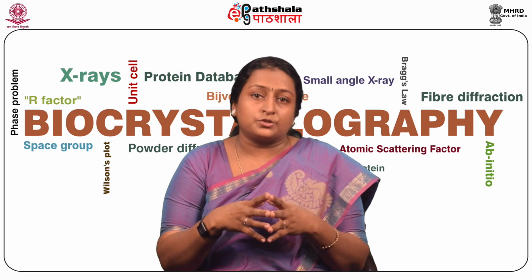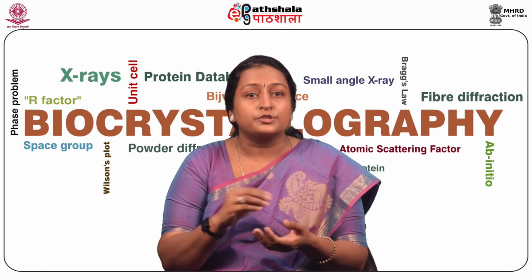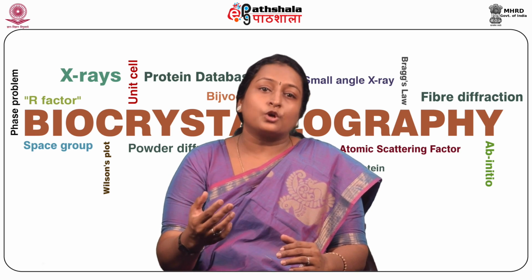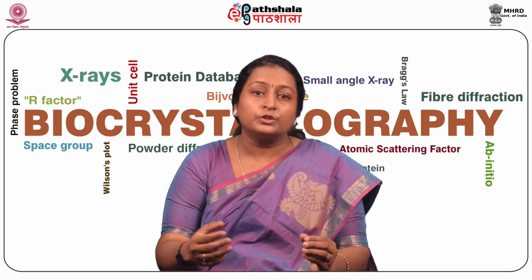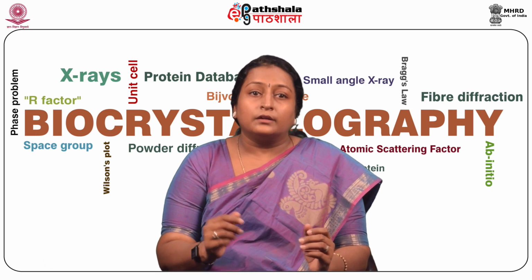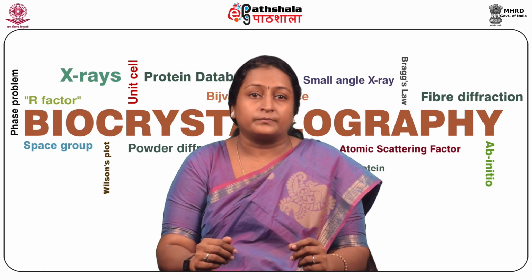Some of the important characteristics of samples for X-ray powder diffraction: a flat plate sample should have a smooth flat surface. If the surface is not smooth and flat, X-ray absorption may reduce the intensity of low angle peaks. Parallel beam optics can be used to analyze samples with odd shapes or rough surfaces. And densely packed, randomly oriented crystallites, with grain size less than 10 microns. These are some of the characteristics one should follow.